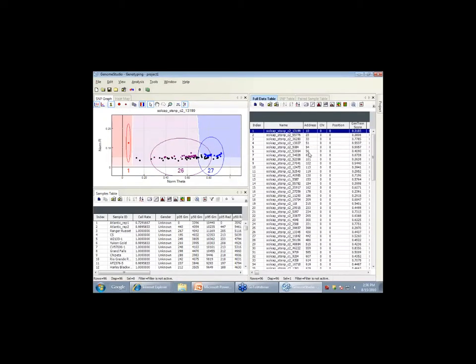So the question was, what do the numbers mean in the name? And the answer is, not very much. As far as you're concerned right here, we have a cross-reference table at SolCAP, which we'll put online shortly, which will show what the sequence is, what the SNP is, and so on. But there is, in the software, in these tables, something that will tell you what the SNP is. You can capture that. But the actual sequence that it's from and so on will be something we cross-reference as part of the SolCAP project independently.